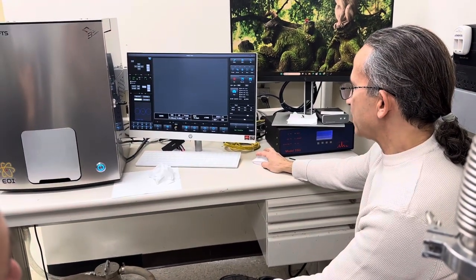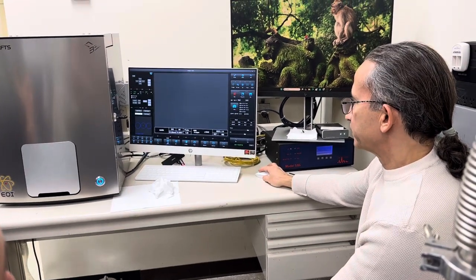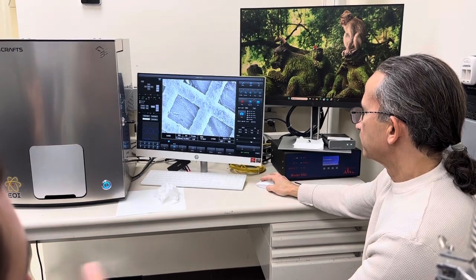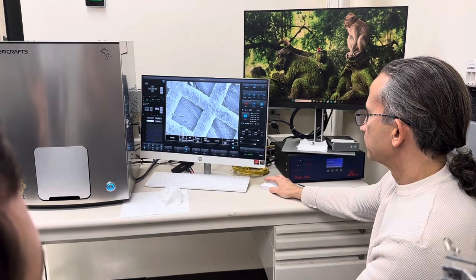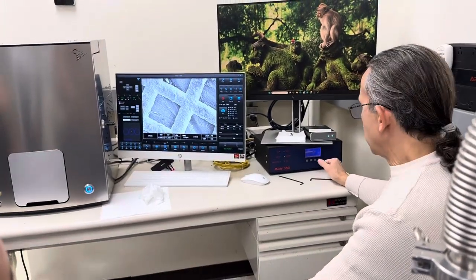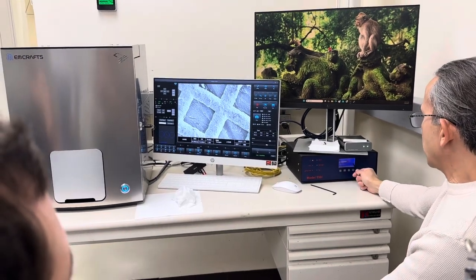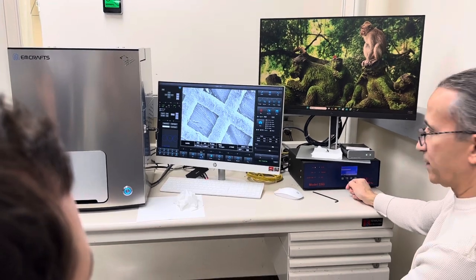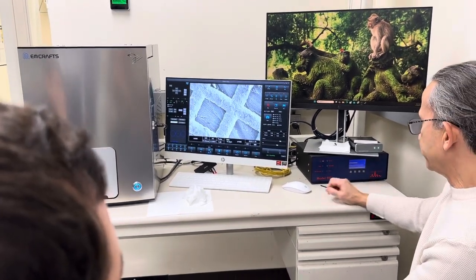So if I bring signal back in, now all of a sudden I start seeing information on this display. It's an auto scale, so it's telling me 2,000 right there. So I roughly have about 1,000 C/S, which stands for counts per second. So 1,000 counts per second.